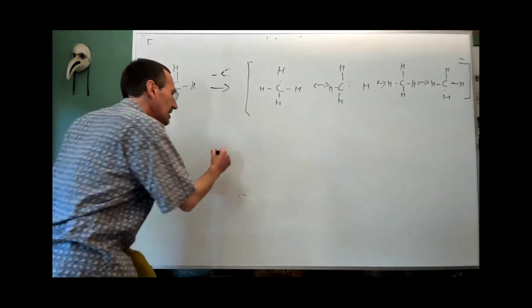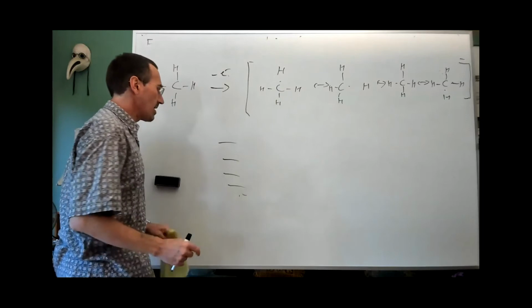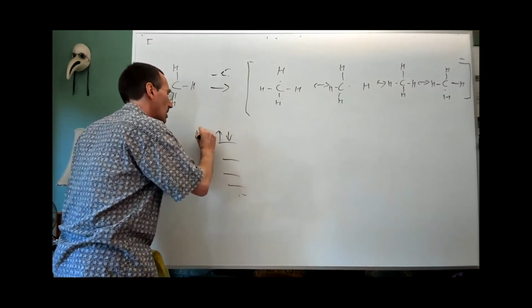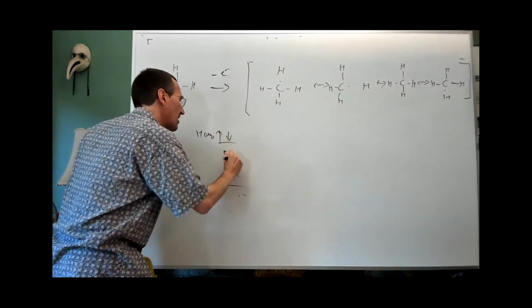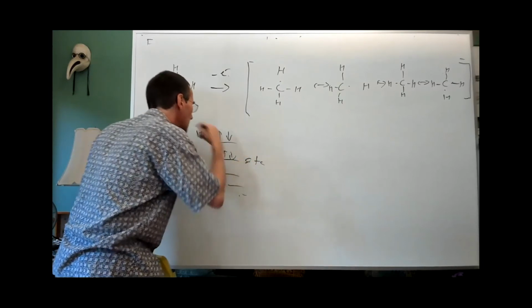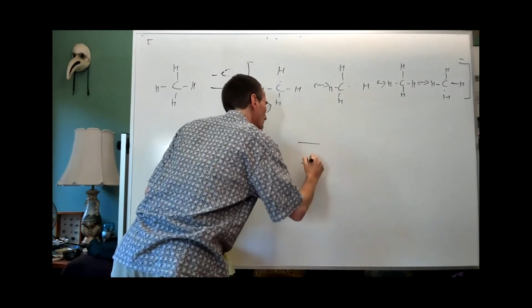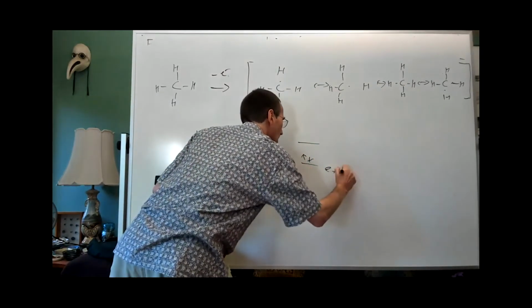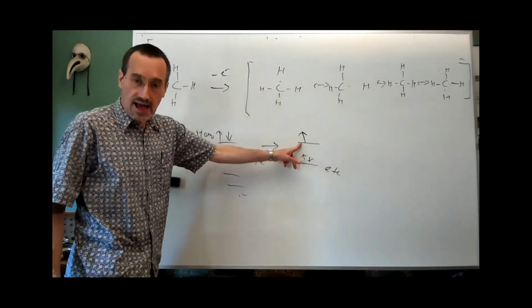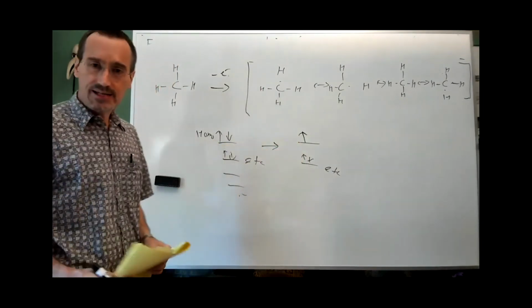But it's certainly easier if you think about some sort of molecular orbital diagram and you imagine, okay, if here's our HOMO, and we have a bunch of filled orbitals and so forth, etc. If you just imagine, okay, we've gone ahead and knocked an electron out of the HOMO and we're making do. Plain and simple.